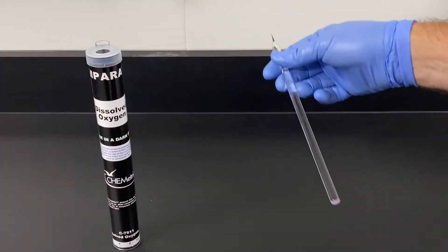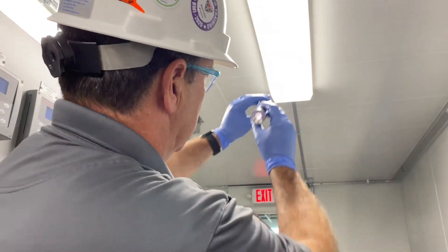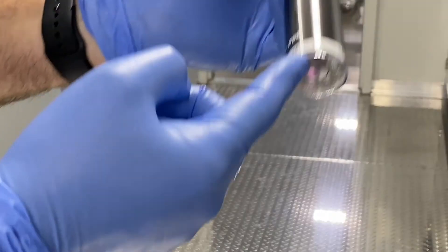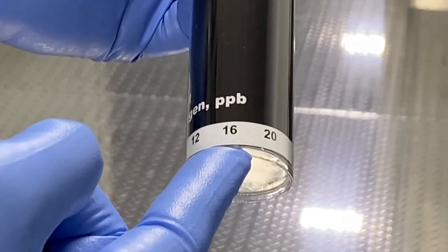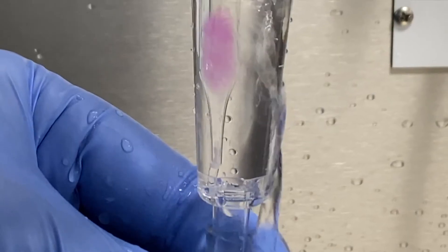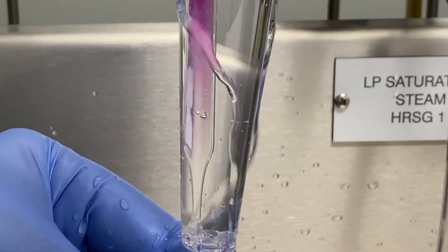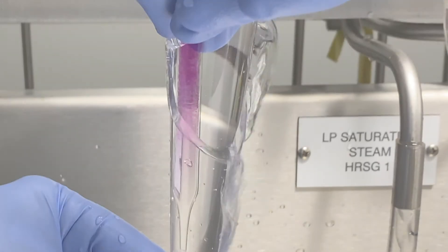The operator inserts the long ampoule into the corresponding round comparator, then holds it up to a source of light to determine the test result. Kemetrix water analysis test kits — they're fast, easy, and accurate. Perfect for use by analysts and operators who want to verify online monitor readings, calibrate monitoring equipment, or conduct primary testing when online equipment fails.